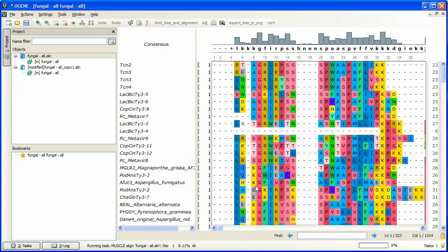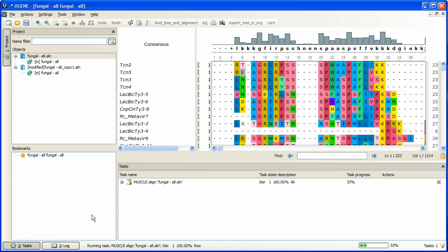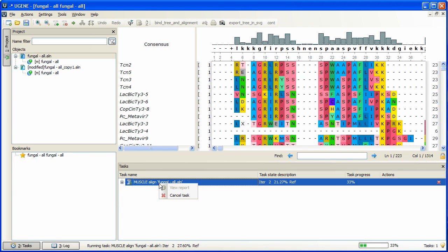Now, the task is running. Note that you can always check the progress of all active tasks in the tasks window. Optionally, you can cancel a task.